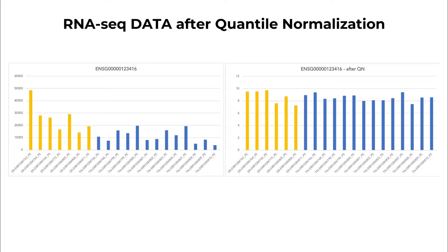Quantile normalization and other normalization procedures are important to transform distributions both between and amongst different samples to have the same distribution. This removes unwanted technical variation that could cause perceived differences between samples when there are in fact no differences in terms of the biology.